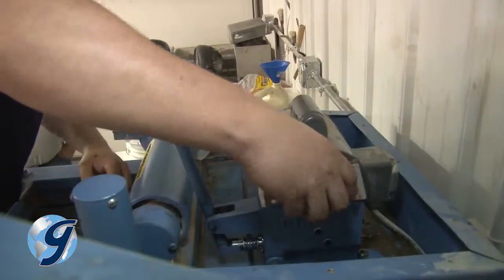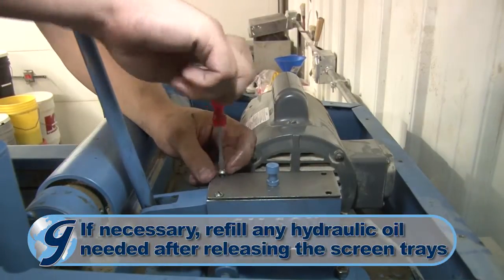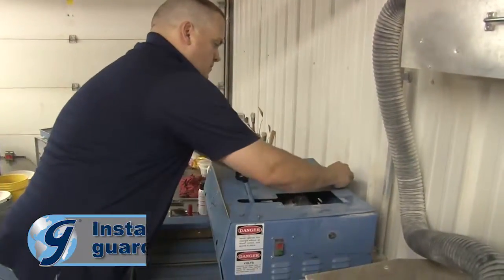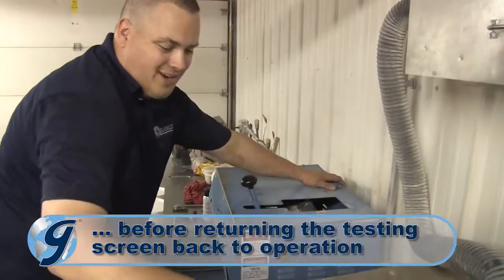Next, install the pump cover on the pump based on the alignment marks made earlier and release the trays. Finally, install all hose clips, safety guards, and covers before returning the testing screen to operation.